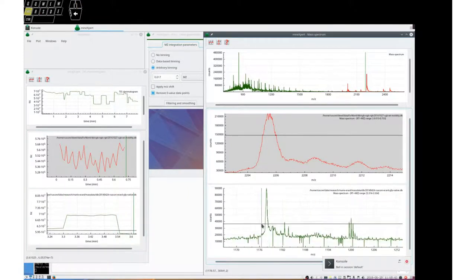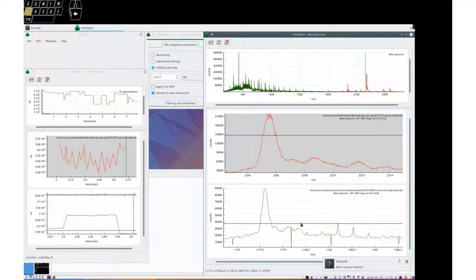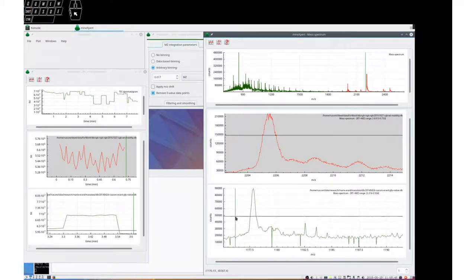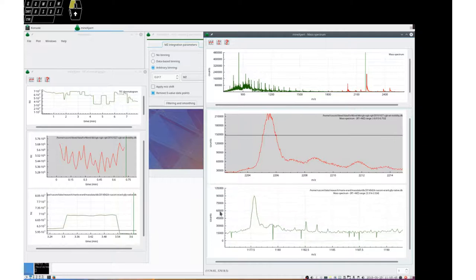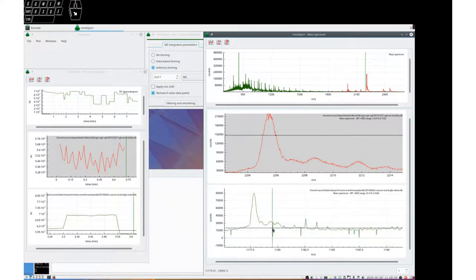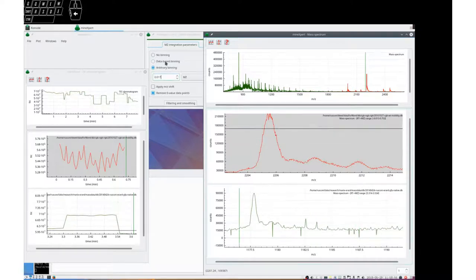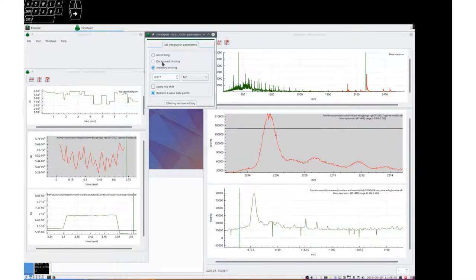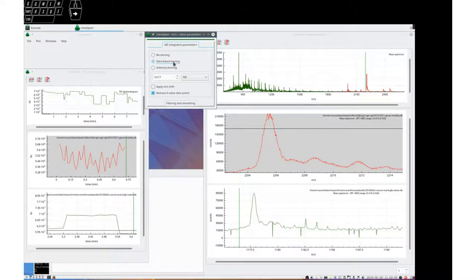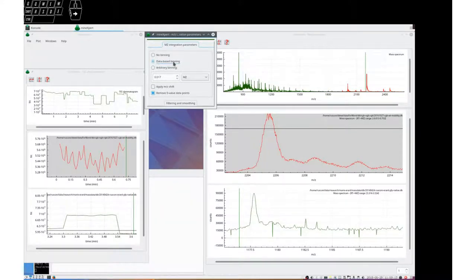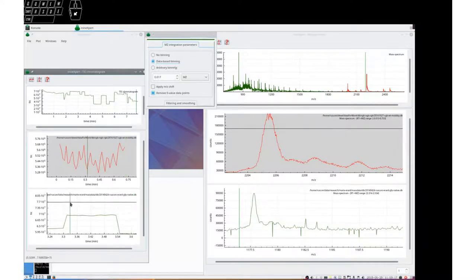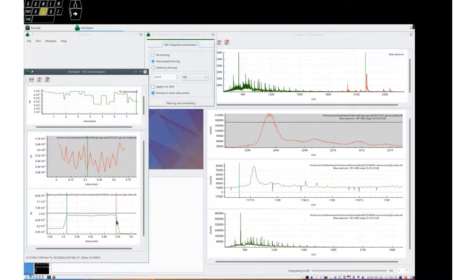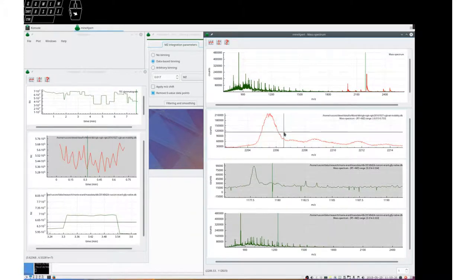We discovered that the trace here is pretty nice unless there are these small spikes, inverted spikes. If we now ask data-based binning, this kind of integration initially computes a set of bins that is based on the bins found in the first spectrum of the spectrum list. And by experience, I know that this is the proper integration manner for these data from the Bruker-Microtof.